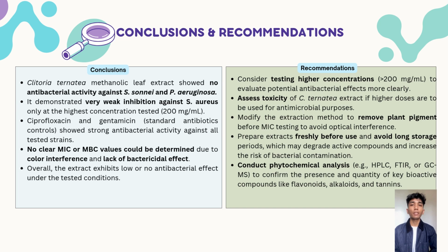It is also important to prepare the extract fresh and avoid long storage, as that may degrade bioactive compounds or lead to contamination. Lastly, I suggest conducting phytochemical analysis using methods like HPLC or GC-MS to confirm whether the key antibacterial compounds are actually being extracted.